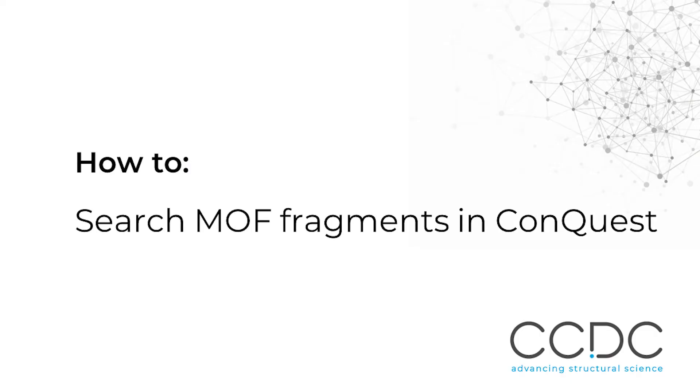Hi, this is Matthew Stout from the CCDC. Today I would like to show you how to use Conquest to search complex Metal Organic Framework fragments. Let's get started.